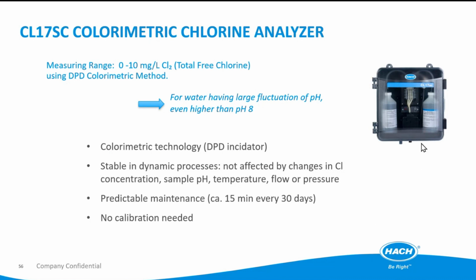This solution is not affected by changes of chlorine concentration, pH, temperature, flow, or pressure. If we use a sensor to monitor chlorine, that solution will be affected by changes of chlorine concentration, pH, temperature, flow, and pressure. So every solution has a strong point and a weak point.